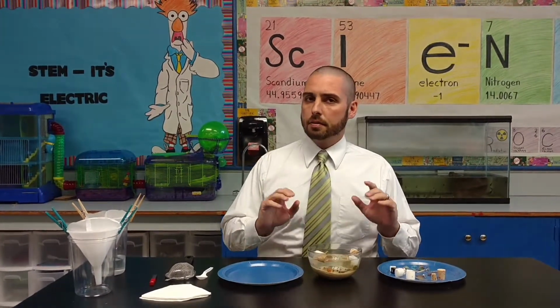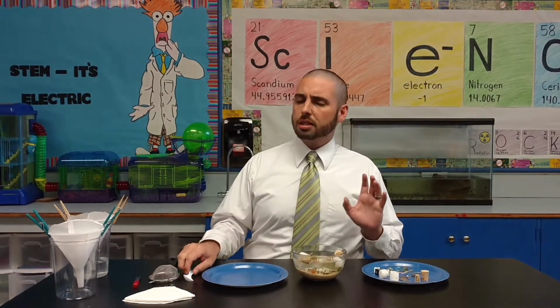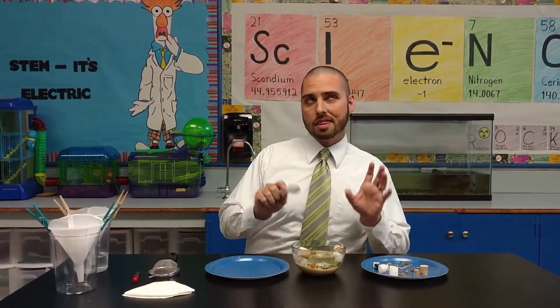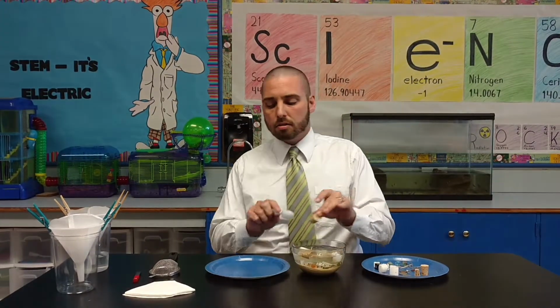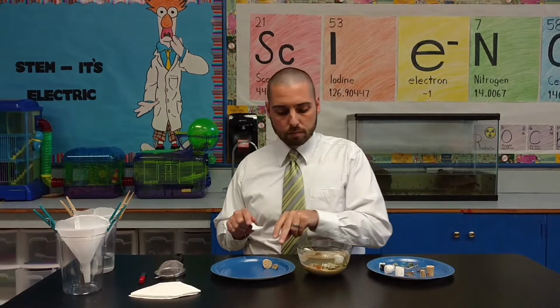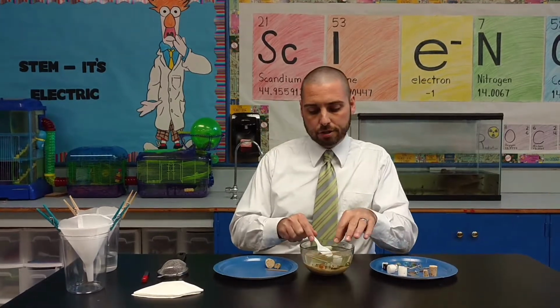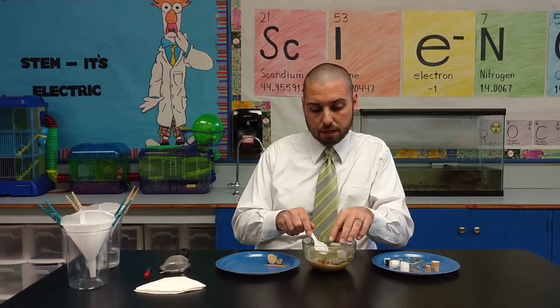So, we gotta clean up, right? Well, I like to begin by instructing my students to utilize a spoon to remove those objects that are floating. So this process is known as flotation. So we're just gonna scoop those items that are floating upon the surface and remove them from our aquatic ecosystem in an effort to repair the damage that we have done.